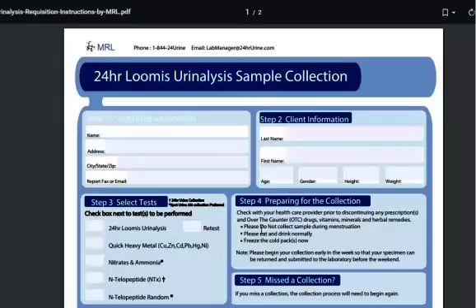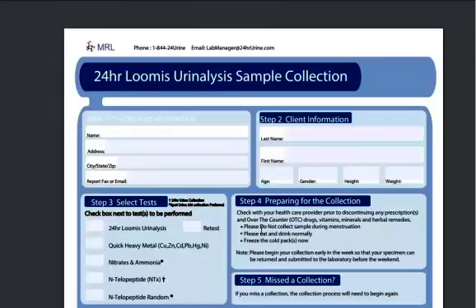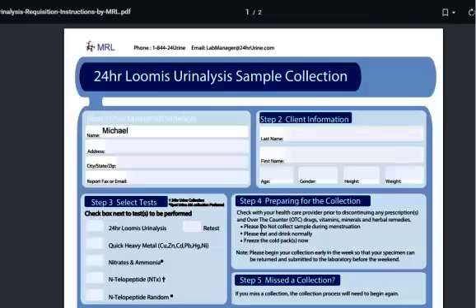This is where you'll insert your information. Okay, the practitioner information will go here. So either the client or you will enter this. If you received kits from us, we already fill these out for you and we put them inside the box. Okay, so let's just put practitioner information here. All right, and then we'll enter the address.